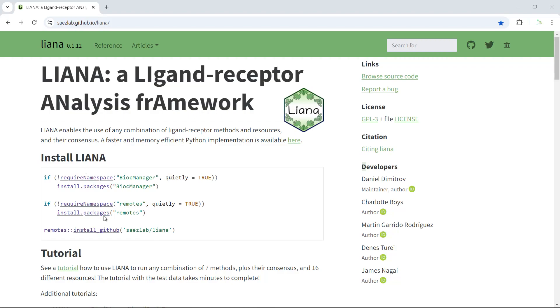I installed the package already. We can go to RStudio and show you how to run the analysis.